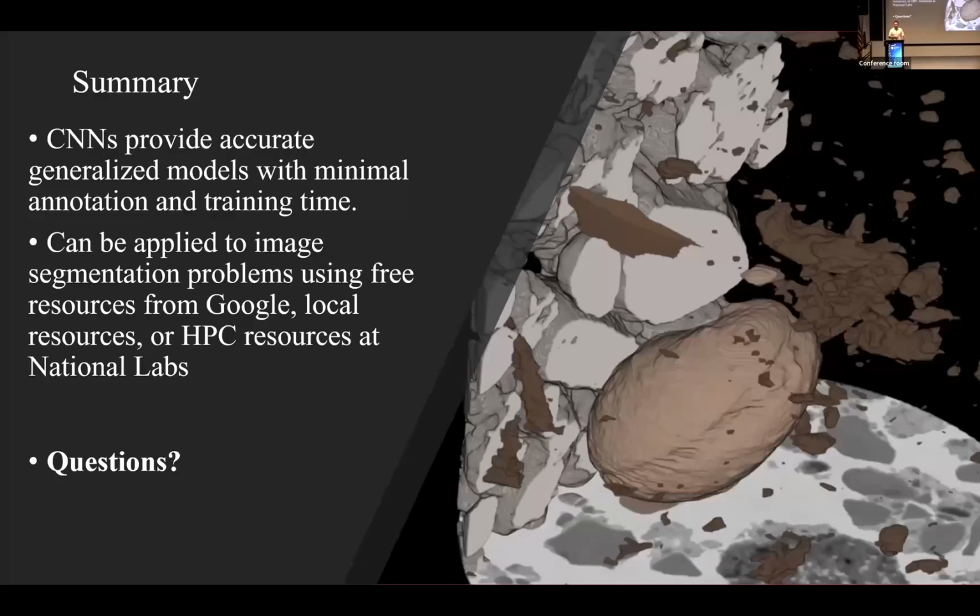Absolutely, thank you. So the imaging is the bottleneck right here, not the evaluation, right? Yes, yeah, absolutely. In this case, for the CT scans, the imaging is the bottleneck. But for say cell phone camera images, things like that, that historically has been a computational bottleneck or a person hour bottleneck.